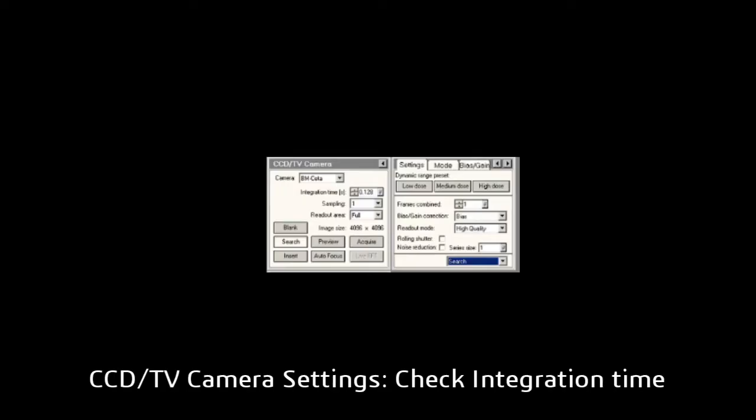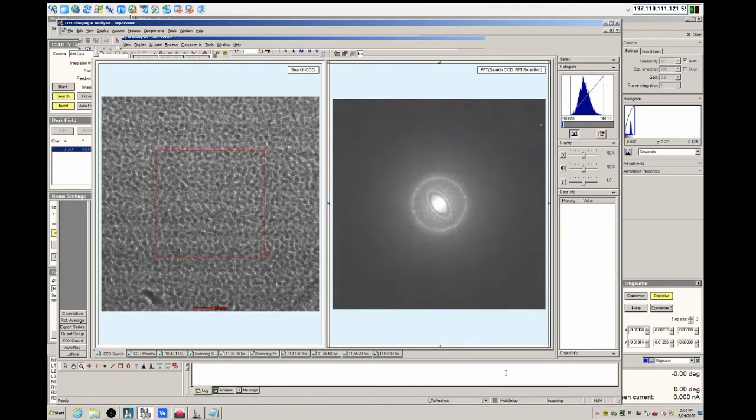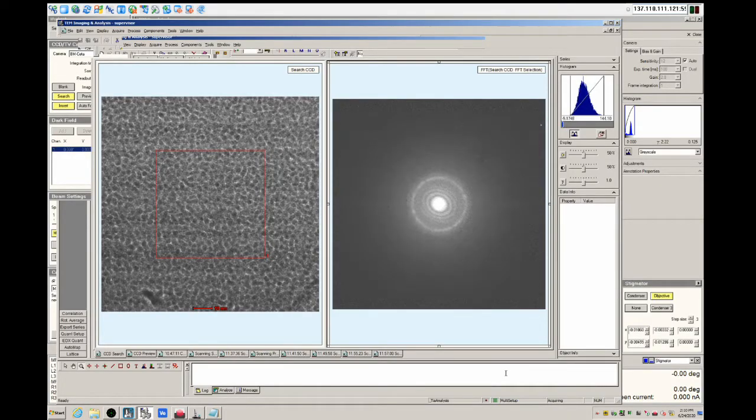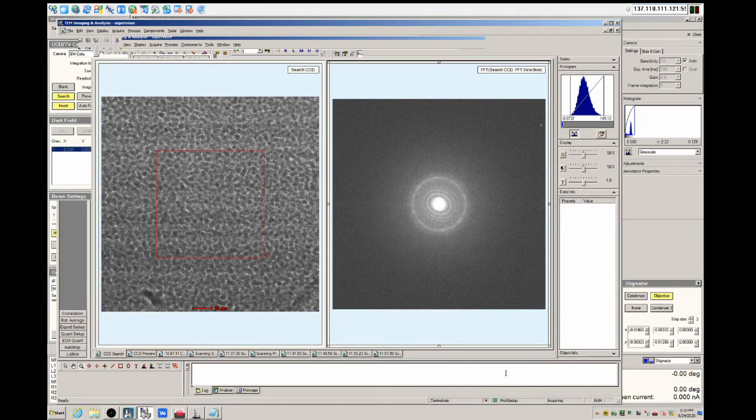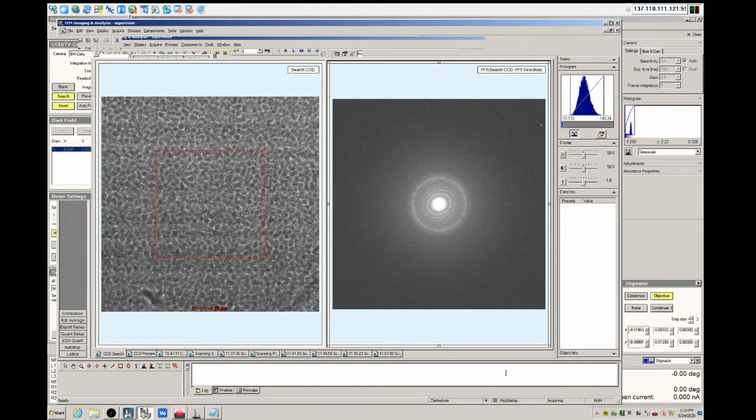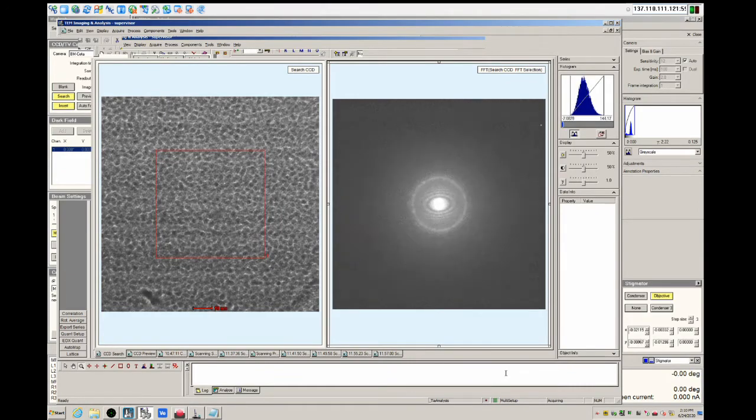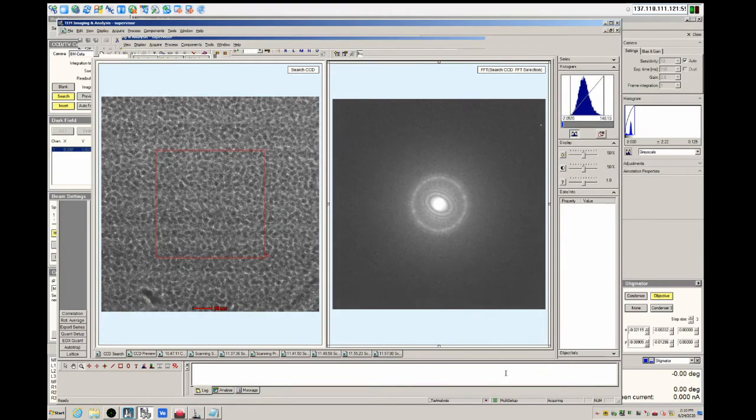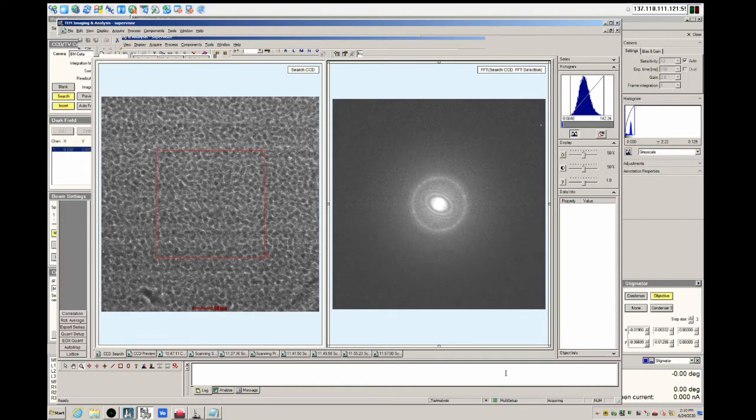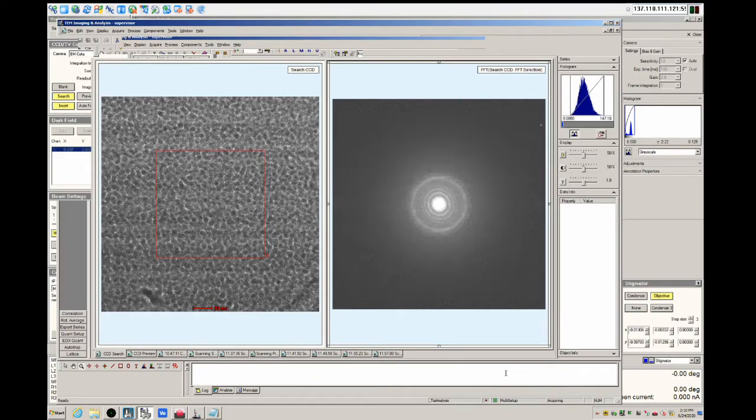You can get a better quality for your transform if you use the SETA camera. Before you lift the phosphor screen and use the SETA camera, please check the camera settings on the top left. In particular, we don't want to burn out the camera, so we must set the integration time to something reasonable. Then, if the camera is already inserted, we can click search to bring up the image on the TIA software. The Fourier transform that can be processed on the SETA camera is a lot cleaner. It's a lot easier to see if it's symmetrical, so you adjust the multifunction X, multifunction Y dials until it looks like on the screen here.